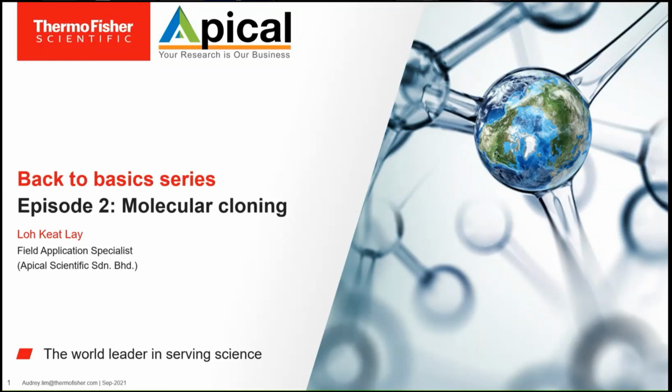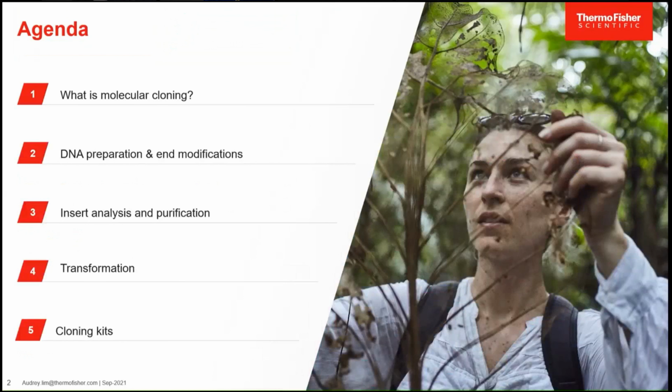In today's agenda, we'll go through an introduction on what is molecular cloning and the basic of it. Then I'll walk you through the various steps of traditional molecular cloning, including how to prepare the DNA insert and vector, followed by the insert analysis, purification, and finally transformation. And I will finish off by introducing to you some of our molecular cloning kit.